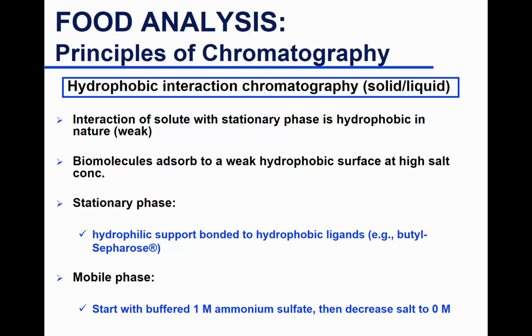Another mode of separation is hydrophobic interaction chromatography. Hydrophobic interaction chromatography is under adsorption chromatography. It's part of adsorptive chromatography because in this case your solute is adsorbing, but it's adsorbing by hydrophobic interactions. So you tend to choose a stationary phase where your hydrophobic interactions are formed but weak.